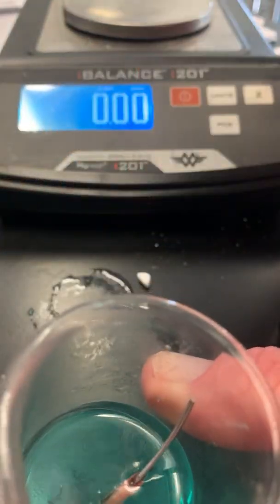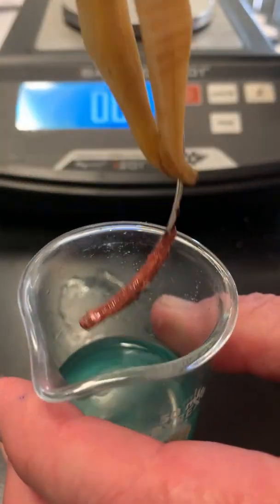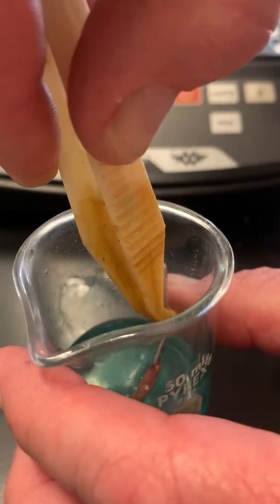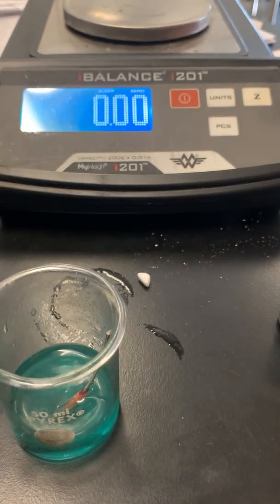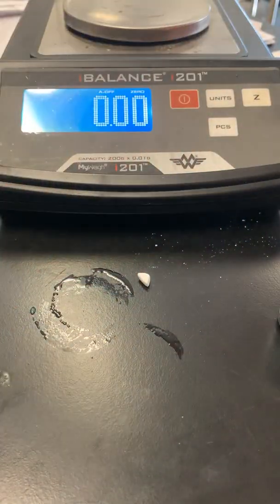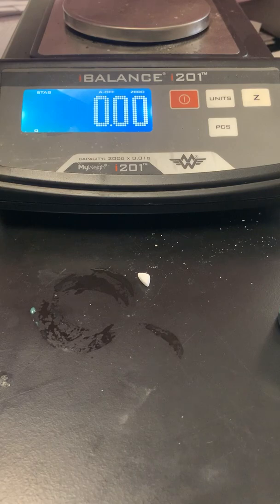And it's surprising that it's still happening because we get a coating, right? So the copper can't get to the aluminum to continue the reaction, but the coating's porous, and so there's still a little bit of reaction happening, and the crystals are building out from the center. So back to my earlier prepared substance.